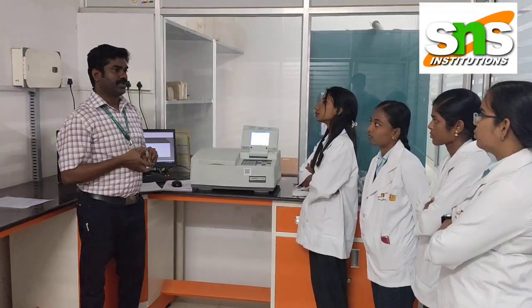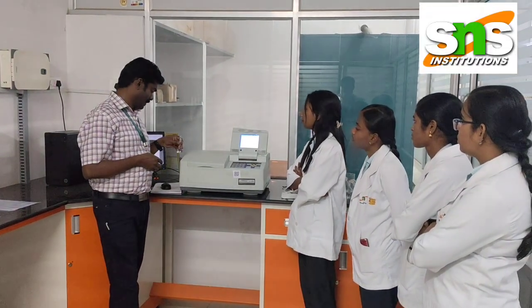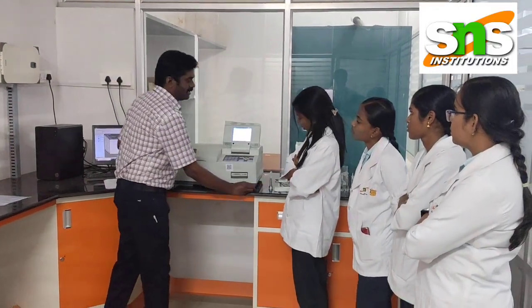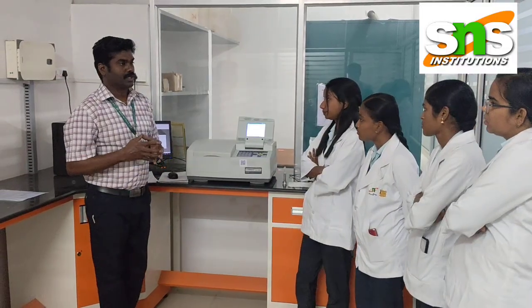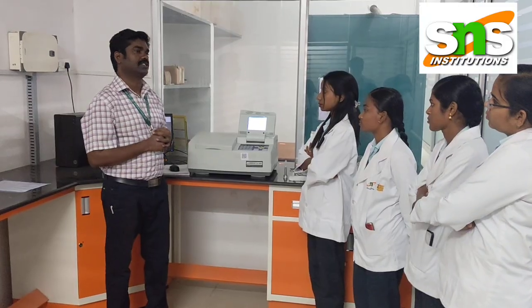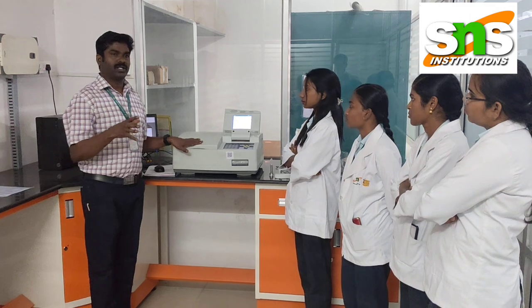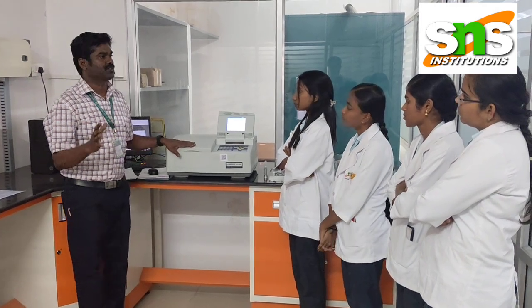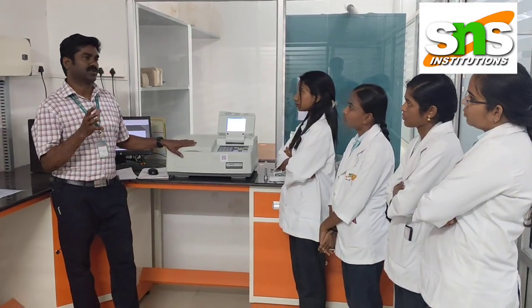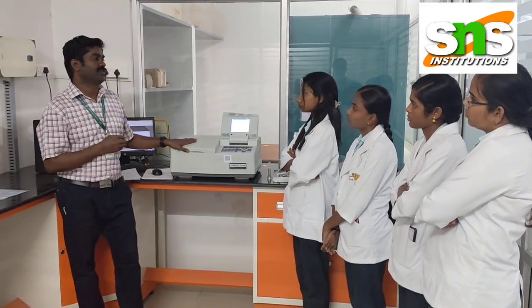So dear students, if you have any doubt related to the UV, you can ask me. Sir, what is the major application of UV? Very nice question. For quality control activities, if you want to find out the percentage purity of any formulation, we can use UV visible spectroscopy. For such formulations, we have to select a suitable solvent and prepare the drug solutions. From these solutions, we find out the absorbance with the help of UV spectroscopy.